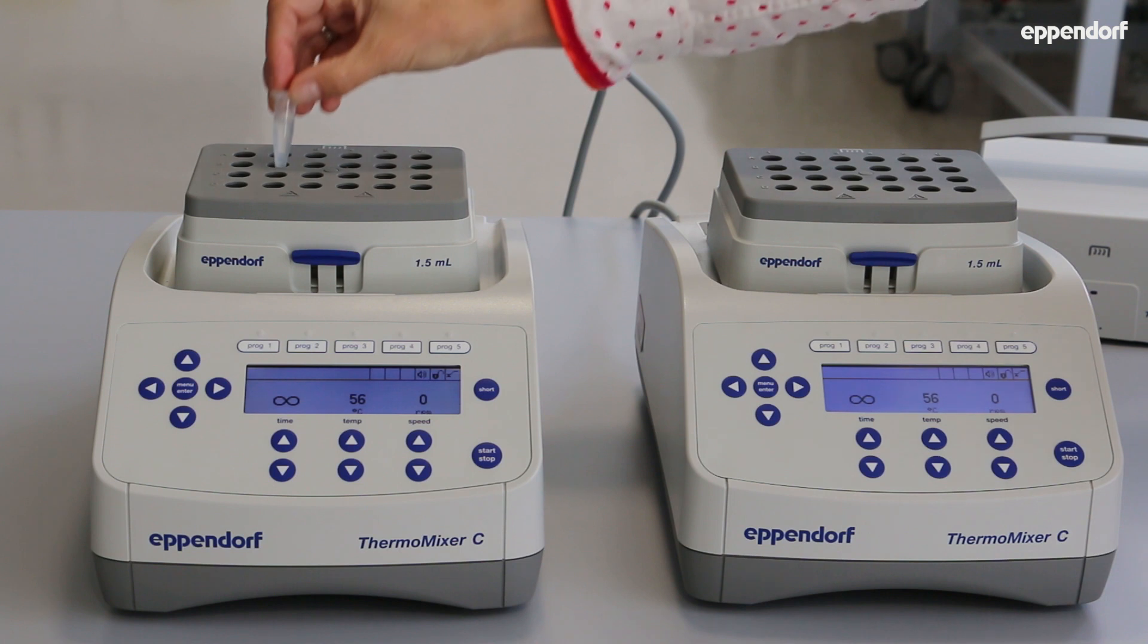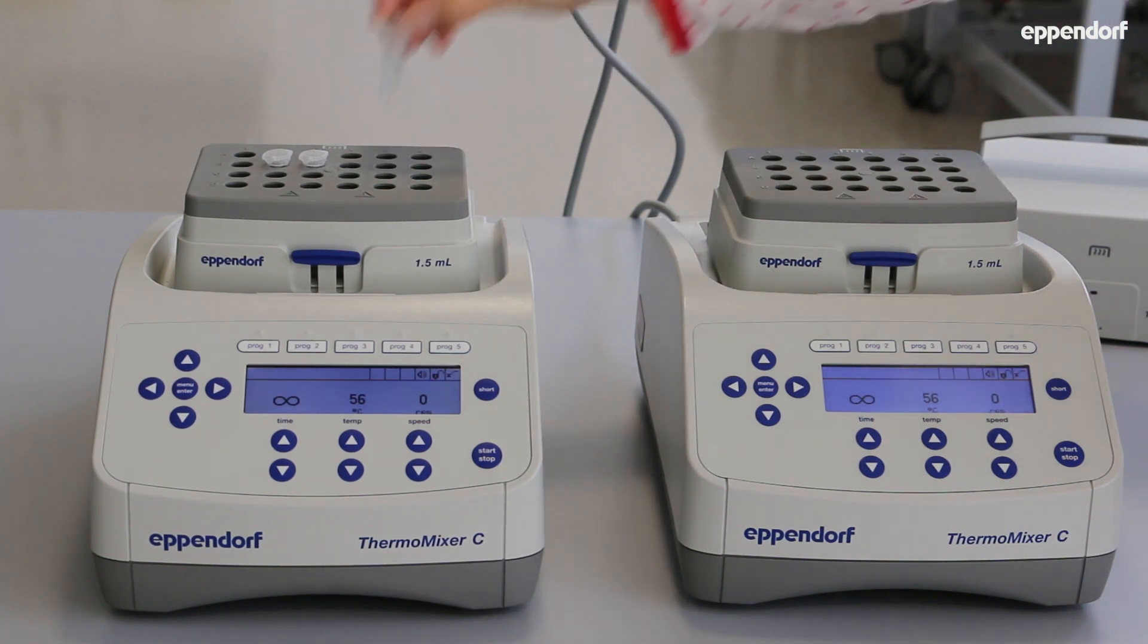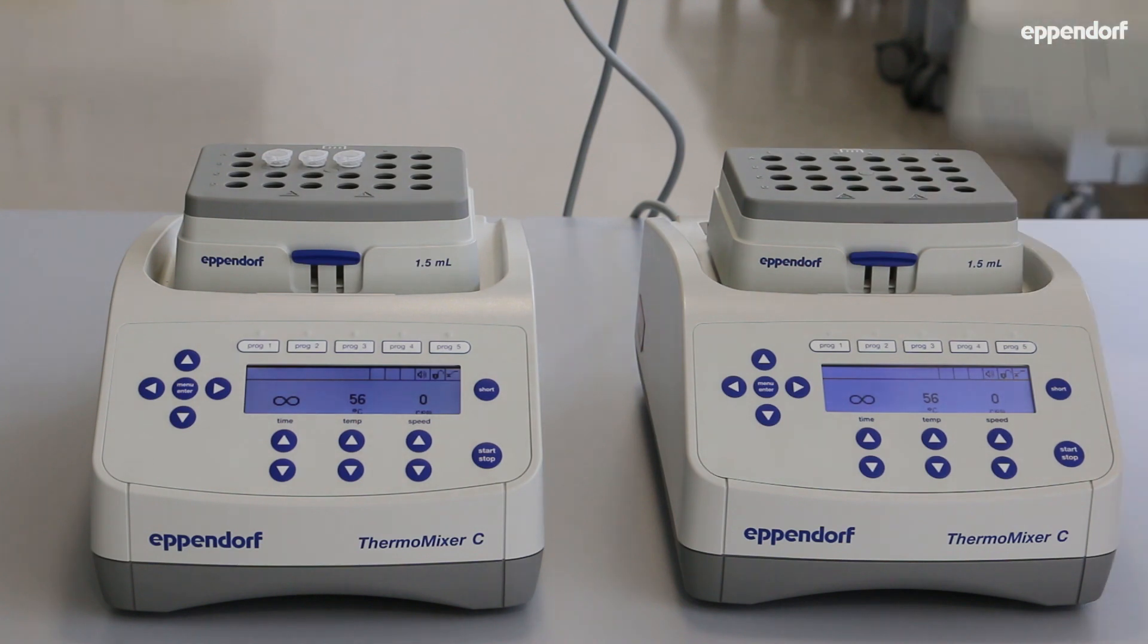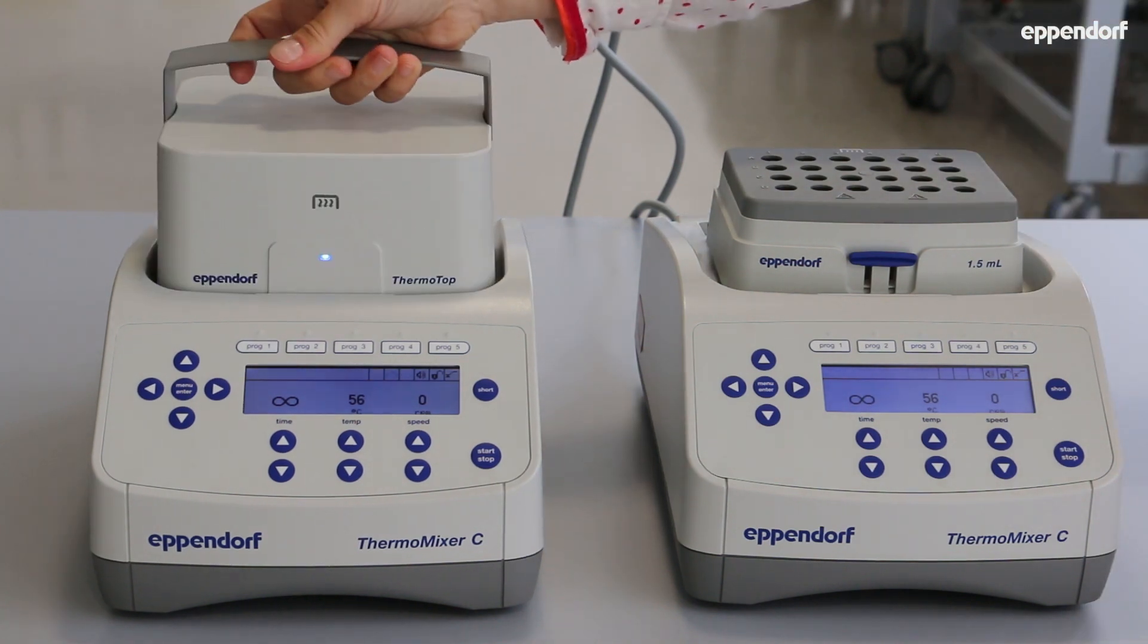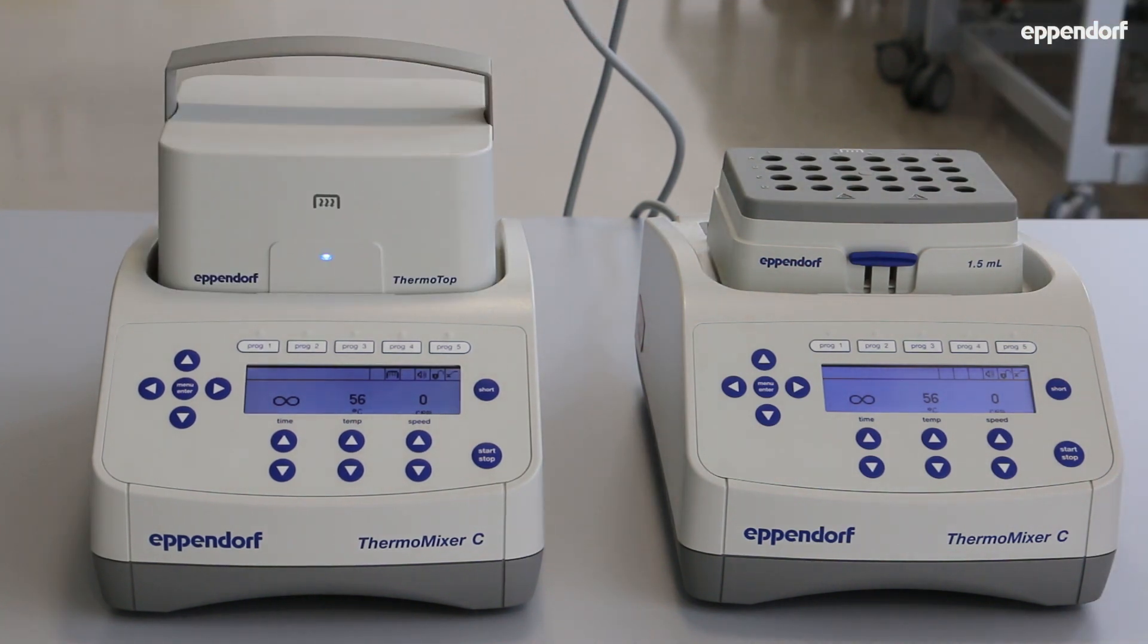To demonstrate the functionality of the Eppendorf thermotop, we filled 1.5 milliliter safe-lock tubes with 1 milliliter of water and heated them up to 56 degrees centigrade, with and without the thermotop.